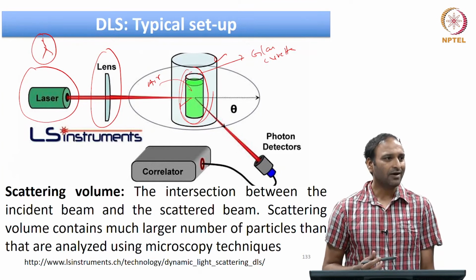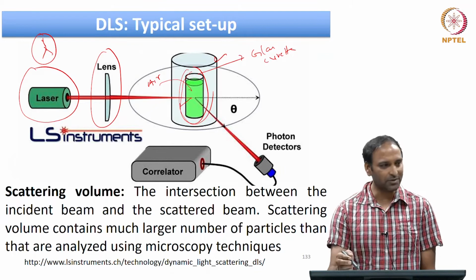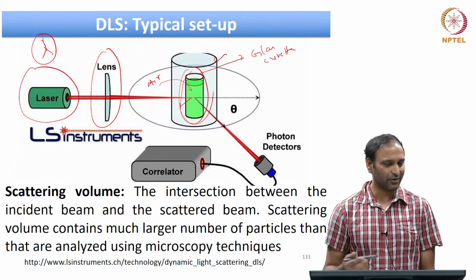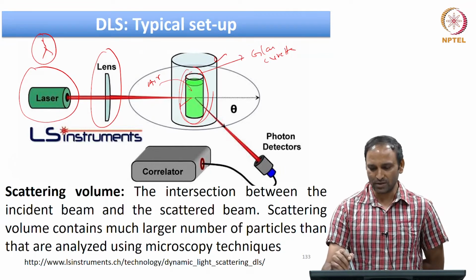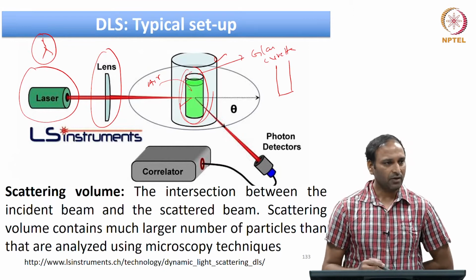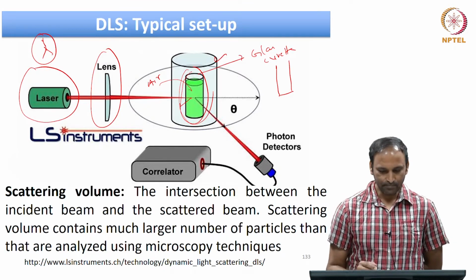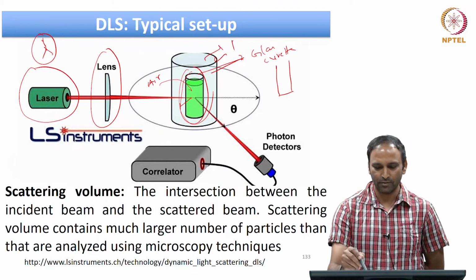Therefore it will essentially avoid some scattering effects that may come from the cuvette itself, from the change in refractive index. But if you don't use glass cuvettes, these days you have plastic cuvettes which can be used without this bath of fluid.